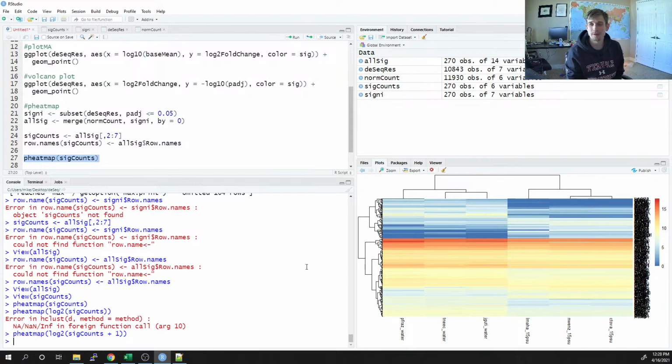So now we can actually see which genes are highly expressed and which genes are lowly expressed, as opposed to the raw read counts. We're looking at the log2, basically the exponent. But this is still not exactly helpful to see how these genes are differentially expressed. So we can do this one step further in pheatmap. There's a function called scale.